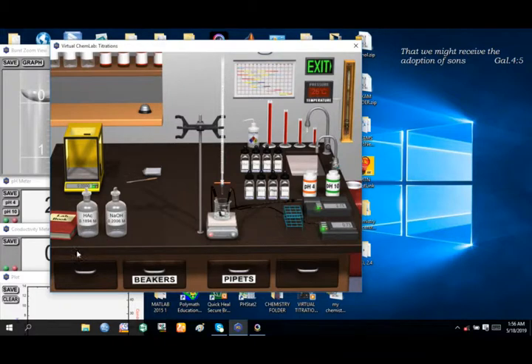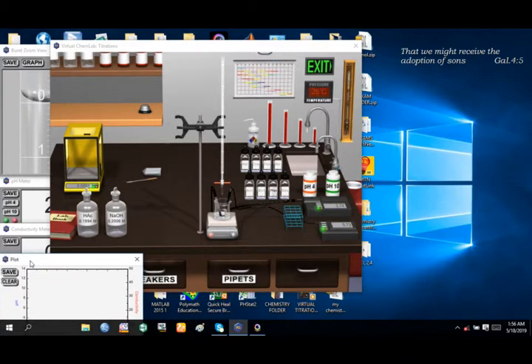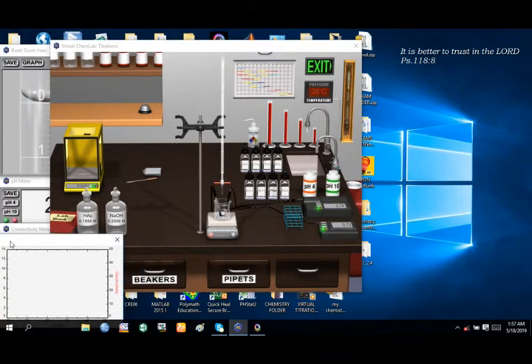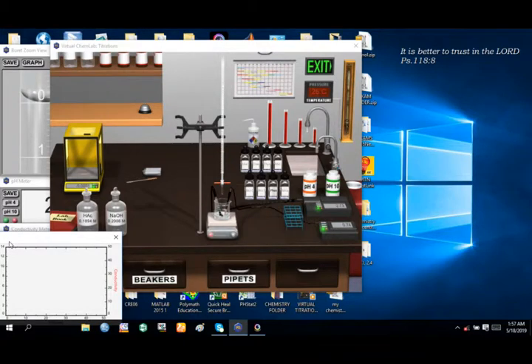And we will now see what will happen in the graph. Our attention is to see what actually happens in the graph, to observe when the titrant is completely consumed by the analyte. And we record the points. At that equivalence point, where the titrant is completely consumed by the analyte, is our point of interest as a chemist. Now we are going to start the titration.